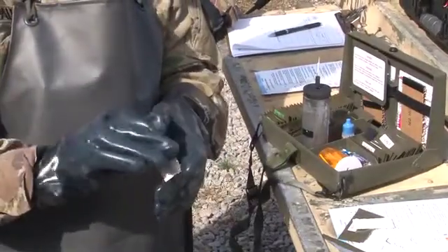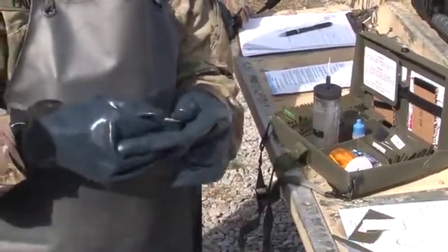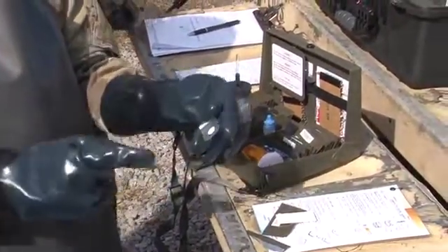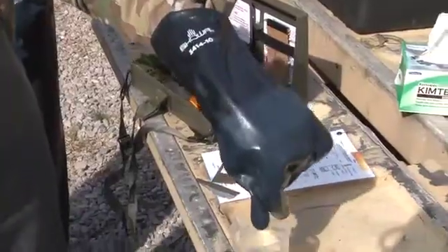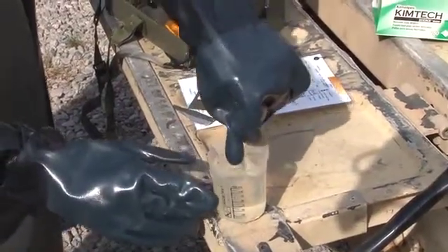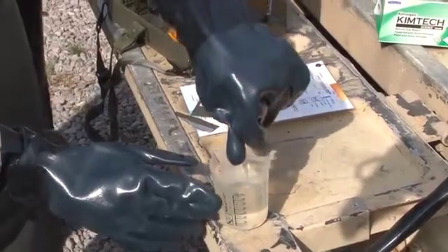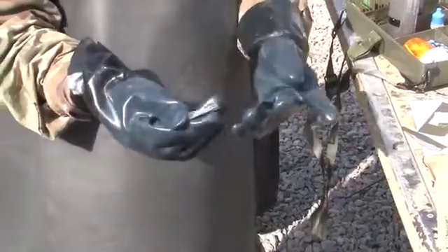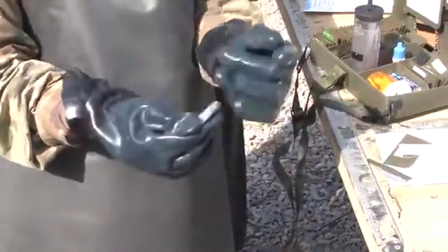Fold back the loose end of the silver cover to the fold mark on the ticket so that only the white test patch is exposed. Now, you'll dip the white patch into a different sample of test water, not in the test bottle. If water does not soak in, fold silver cover back over the white patch and massage ticket to wet through.